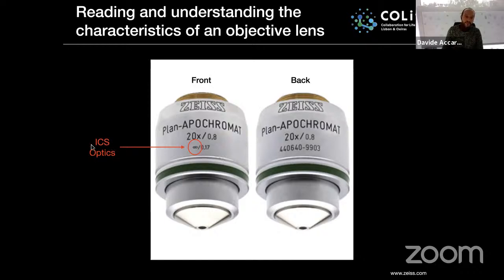Okay, so this stands for ICS optics, which I hope I will remember correctly. It is infinity color corrected optical system. Or as Peter Evennett teaches, this is like an infinity corrected lens, so it projects the light parallel. This is not extremely important for you, but it is important in case you are considering building your own optical system, or doing optical technology development, for example.